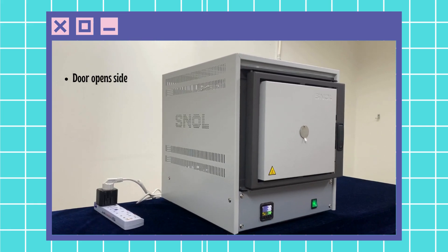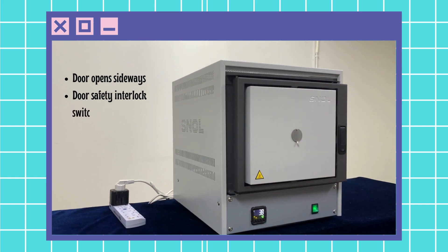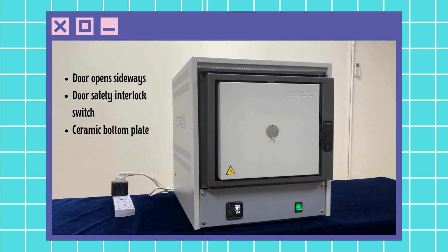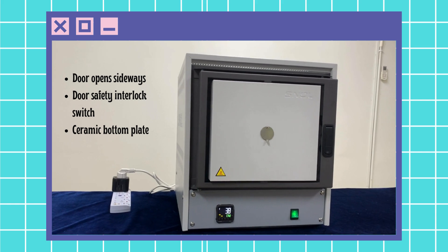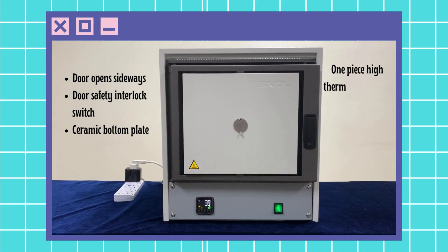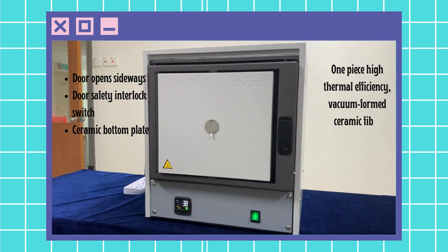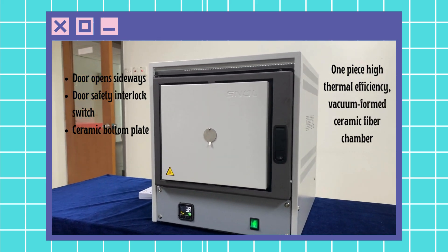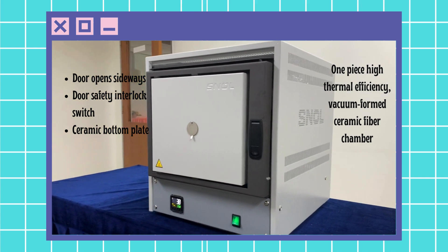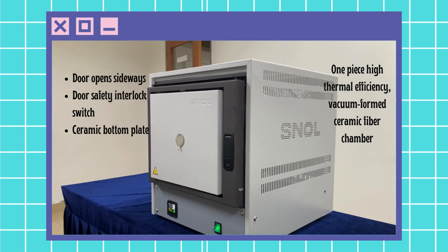The SNOL 0.2 over 1100, LSM01, is a universal laboratory furnace for material testing and heat treatment up to 1,100°C with a volume of 0.2 liters. This furnace has a one-piece high thermal efficiency vacuum-formed ceramic fiber chamber, outside casing with metal sheet powder-coated grey, door opening sideways, door safety interlock switch, and ceramic bottom plate.